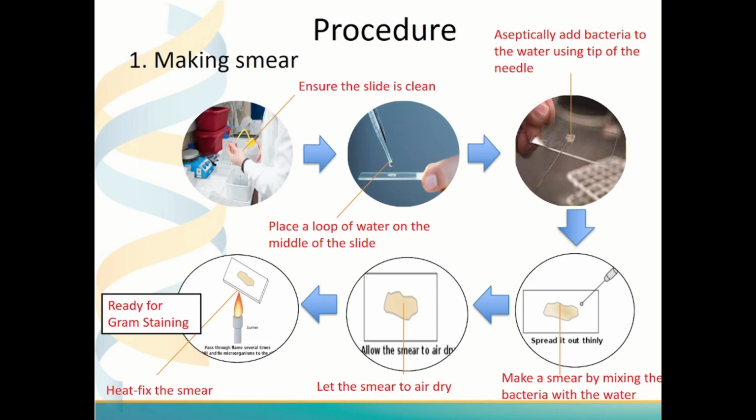And then we can aseptically add bacteria to the water using the tip of the needle, and make a smear by mixing the bacteria with water in a circular motion. The smear should be slightly cloudy, as it means that the bacteria has mixed with water. After mixing the bacteria with water, we can let it dry.